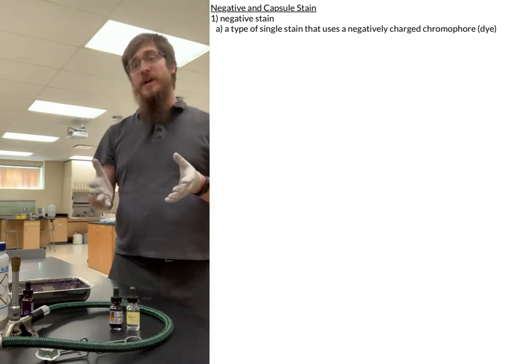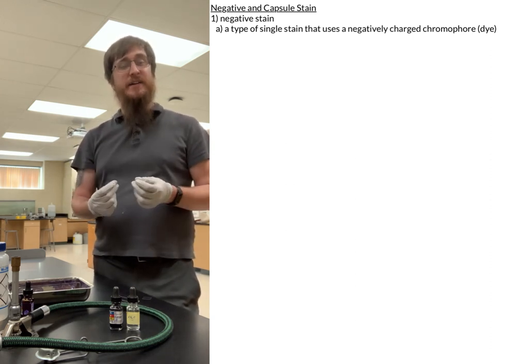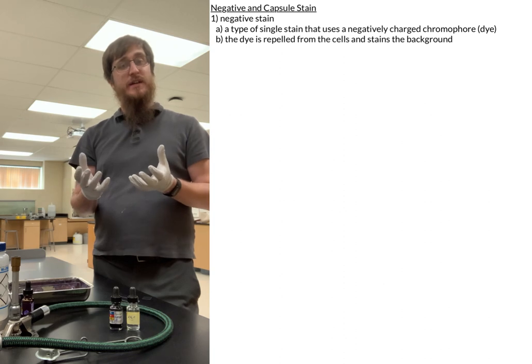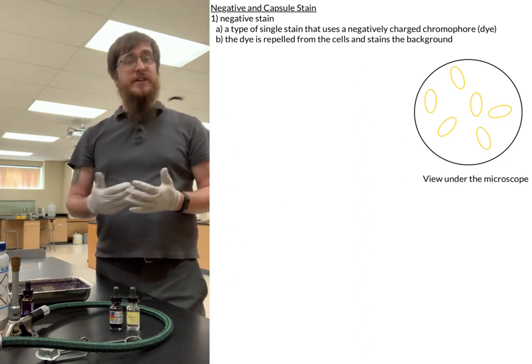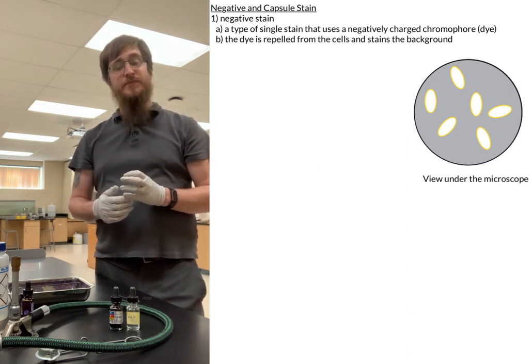And the main way that the negative stain works is that it utilizes a negative chromophore, or a dye, and its basic goal is to be repelled from the cells that we're trying to stain, and we're going to stain the background itself. So because of that, normally when we look at a negative stain down the microscope, we end up seeing a dark background with lightly colored cells.